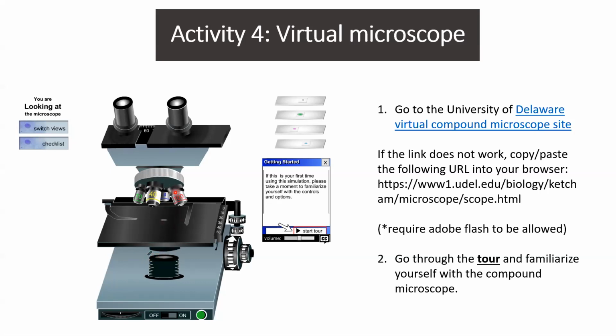You will always put your microscope at 4x. So make sure your microscope is at 4x. Bring your stage all the way down so you have a huge working distance here. Clip in your microscope slide using these clips. The video will show you how to properly clip in a microscope slide.